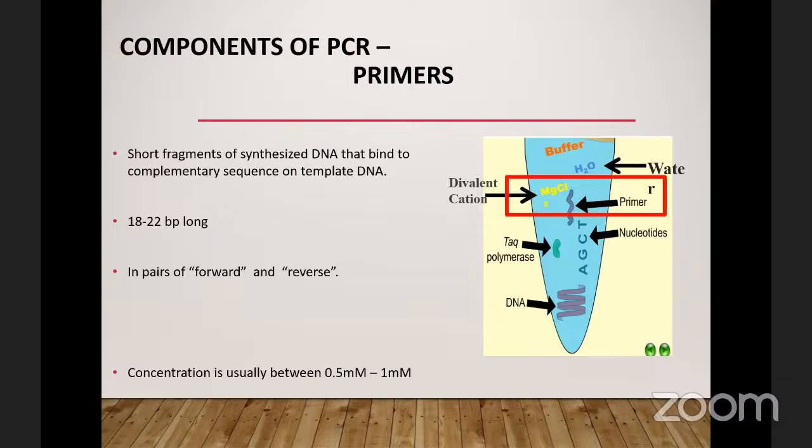What you are seeing here is the PCR reaction tube, right? And the things that are inside. Because normally the manufacturer makes a reagent, right? You want to make a PCR. You are not going to say, oh, let me search for primers, let me design primers, let me synthesize primers, let me get the bivalent cation, magnesium ion, and measure the quantity I will use. No, all of these have actually been incorporated in the reagent you are purchasing, right? So all you need to do is to make sure that your reagent is maintained in the proper temperature.